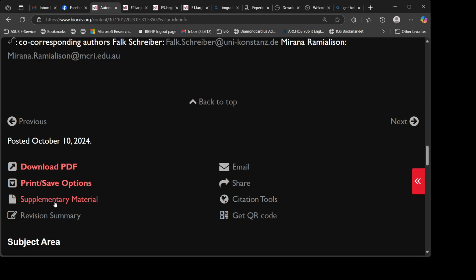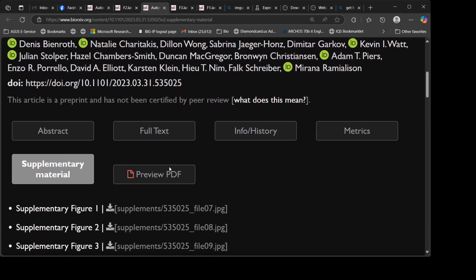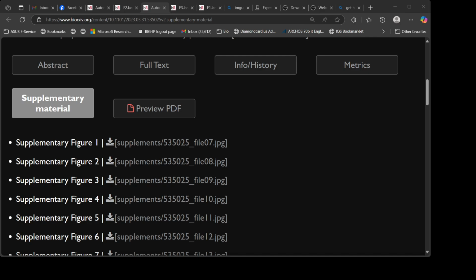Secondly, while VT3D and Stitch 3D support the assembly of 2D slices into 3D, they lack functionality for native 3D ROI selection, limiting the ability to isolate and investigate spatially restricted cell populations across the 3D stack.